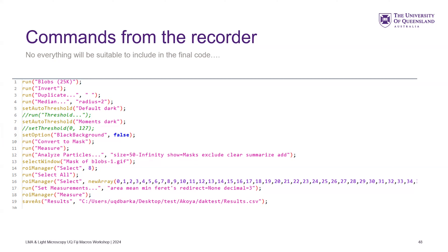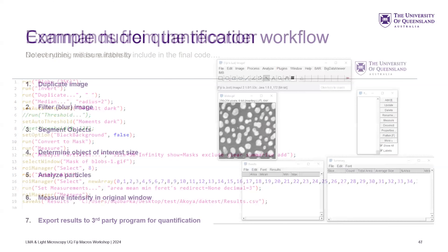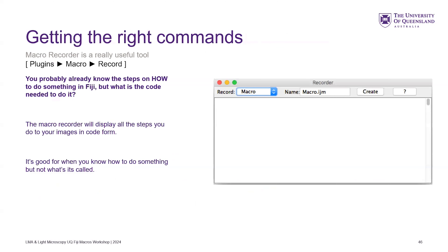This is one way to develop the code, because you probably know what you want to do. When you're testing, you might have to go through a number of steps — which threshold should I use? What cutoff size should I use? You'll be doing these anyway, so get in the habit of opening the recorder window because it's useful.